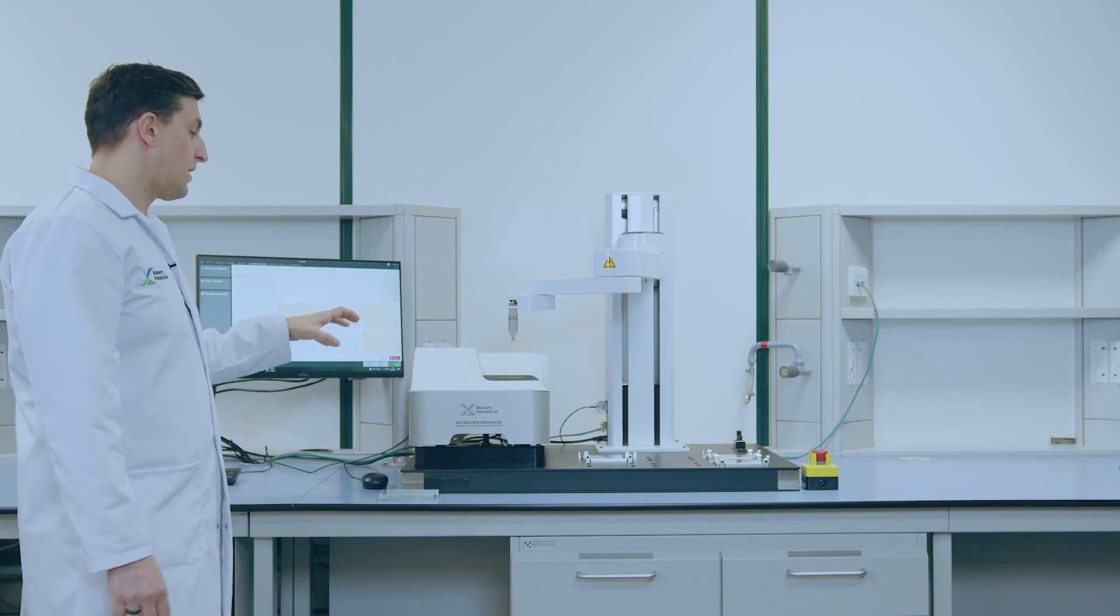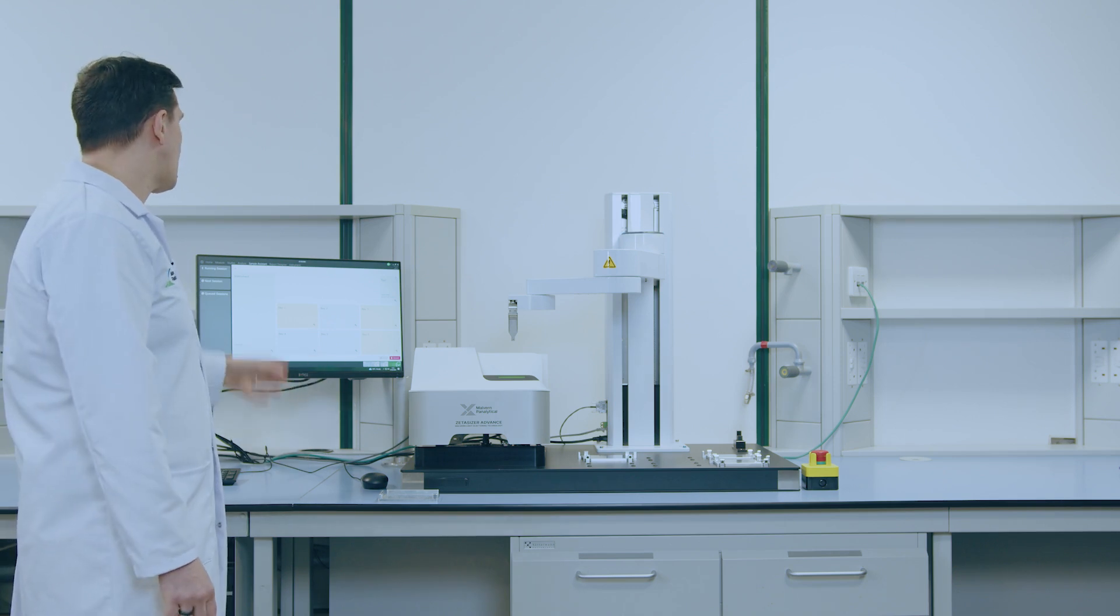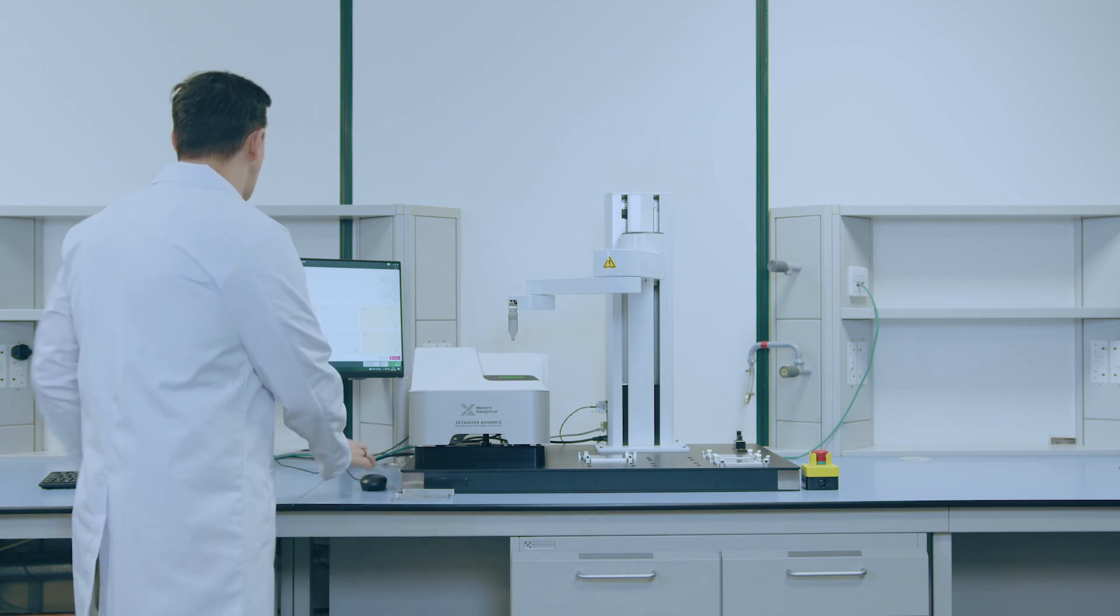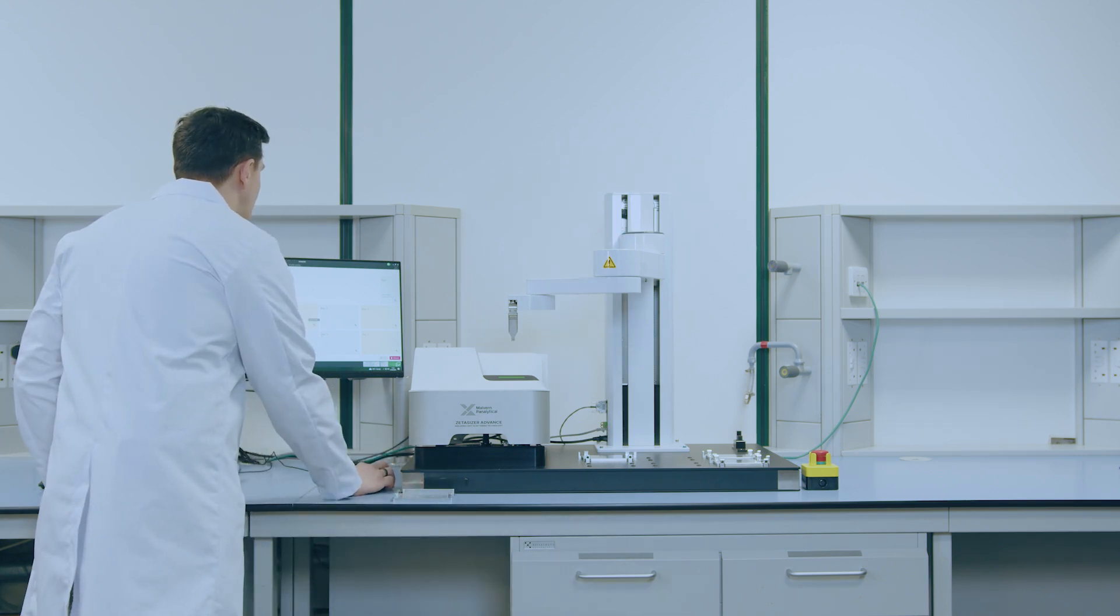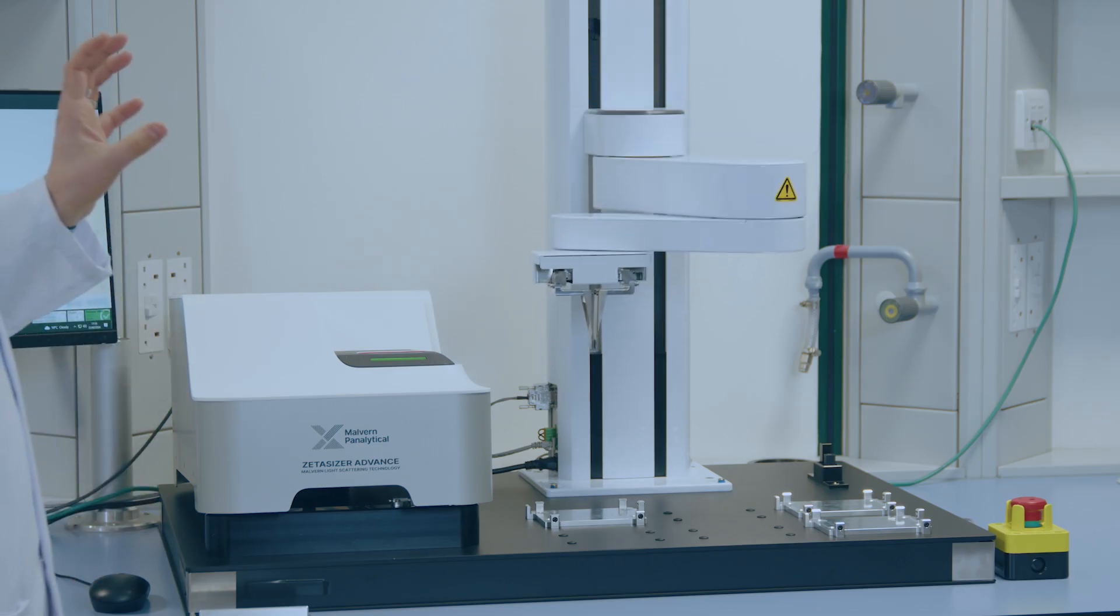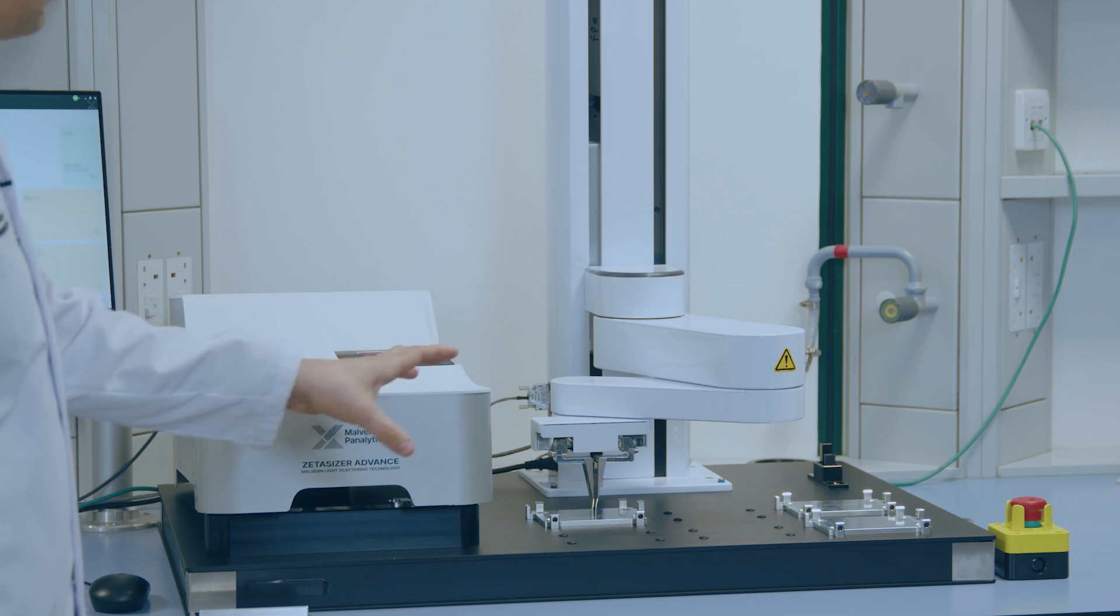Once we configure the position of the tool holder and of the Zetacizer, the last step is to record the position of the trays. For this operation, you will need a tray calibration tool. Once you are ready to perform the operation, just press the configuration tab and the robot arm will initially find the position of the tray.